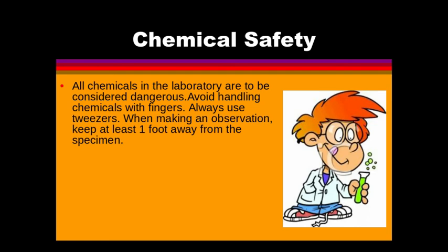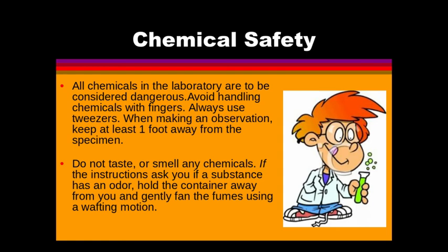Chemicals in the lab are to be considered dangerous. Avoid handling chemicals with fingers. Always use tweezers. When making an observation, keep at least a foot away from the specimen. Do not touch, smell, or taste any material. If the instructions ask if you have a substance with an odor, you're going to hold the container away from you and you're going to waft the fumes to you.